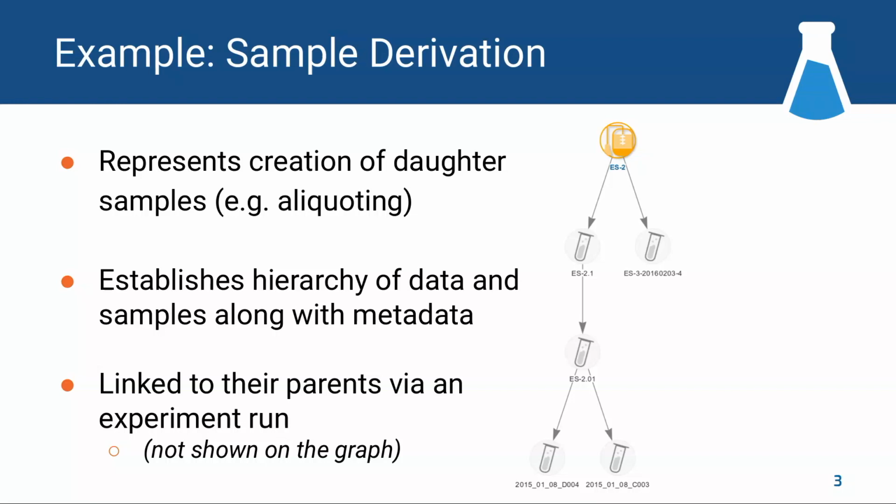There's the hierarchy of samples that can be created through the lineage. In this example, I've got at the very top an expression system. And the expression system, this is something that we have in Biologics. And so this lineage is showing samples that are derived from an expression system that may have come from an experiment where you're pulling samples out.